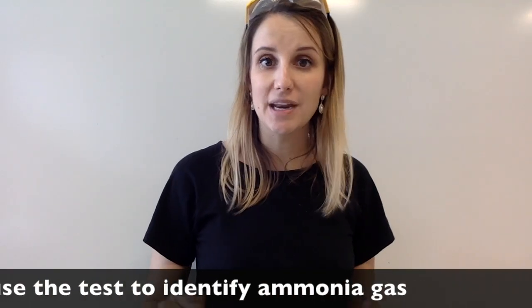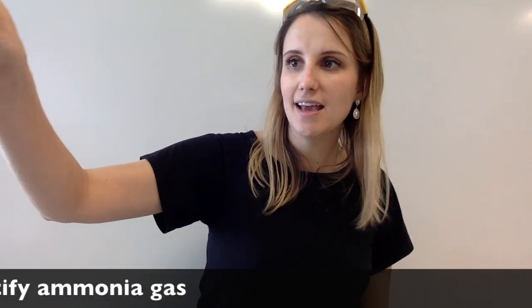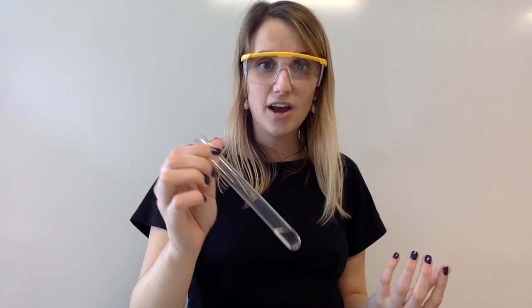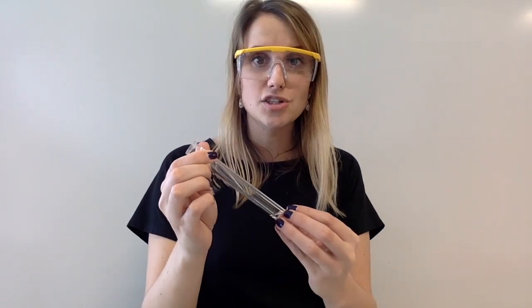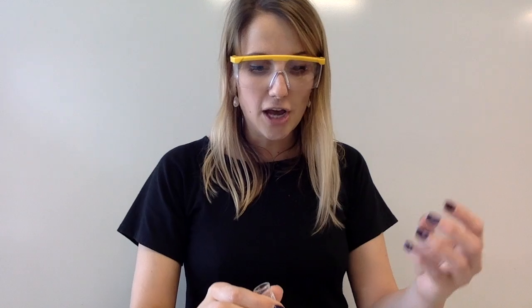The way I'm going to make my ammonia today is I'm going to take a sample of ammonia solution, and what I'm going to do with that is warm it up very slightly, which will encourage the ammonia to evaporate and therefore us be able to test for it.